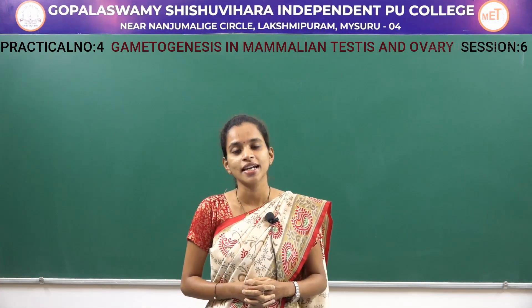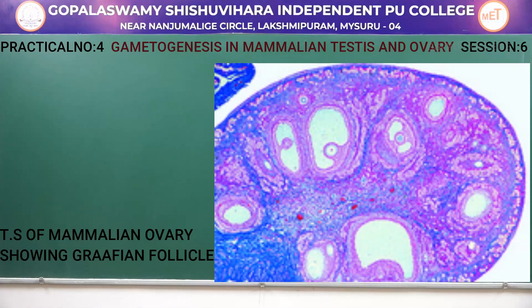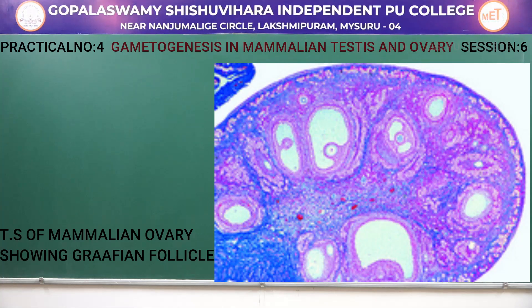Next we will study the transverse section of mammalian ovary. On the screen you can see the transverse section of mammalian ovary. The ovary is covered with a germinal epithelium. The cortex contains follicles which develop into different staged follicles, and finally — as you can see on the screen — a larger structure, the matured Graafian follicle.